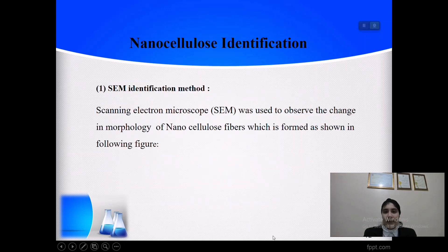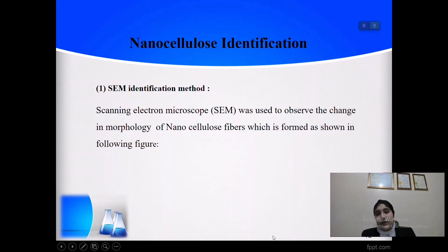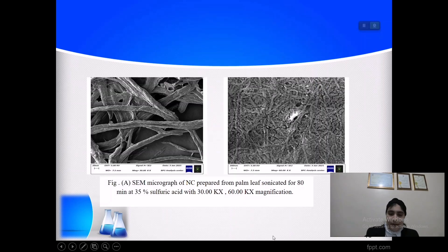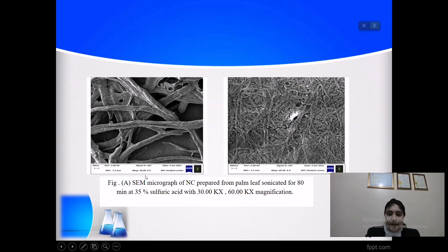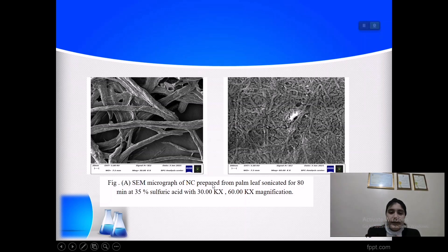The results are proved by two identification methods. The first is SEM — scanning electron microscopy — used to observe all changes in the morphology of nanocellulose fibers. As shown in the figure, we can see the SEM of nanocellulose for 80 minutes with 35% sulfuric acid at different magnifications.